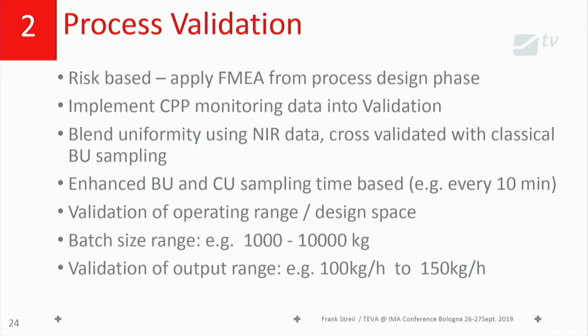It was also cross-validated with HPLC testing. That was, by the way, also part of the method validation. So you see the analytical method validation and process validation were interlinked during validation batch manufacturing, and it was not, as it is for the batch approach, something done before process validation.